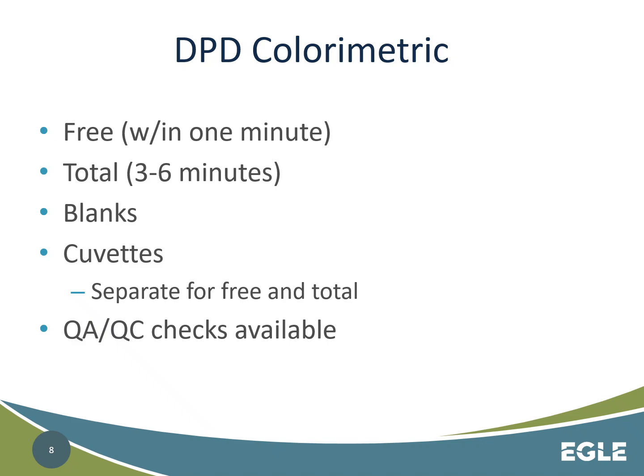Now the blanks, like I was saying, for your low, which is the typical one we're taking out in the distribution system, it's typically a cuvette that only holds 10 milliliters.